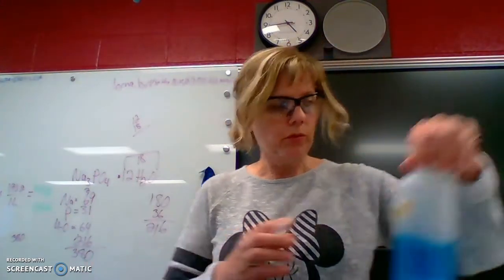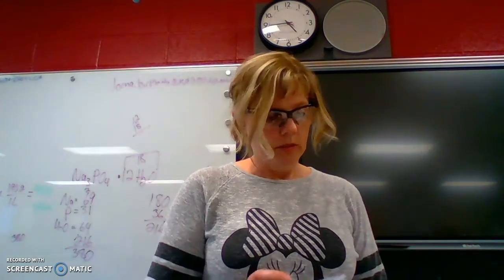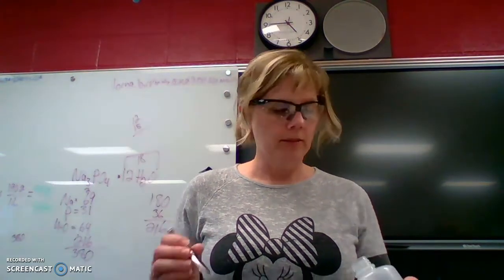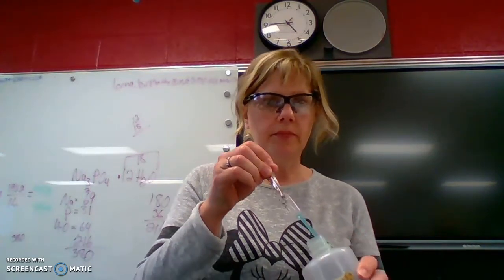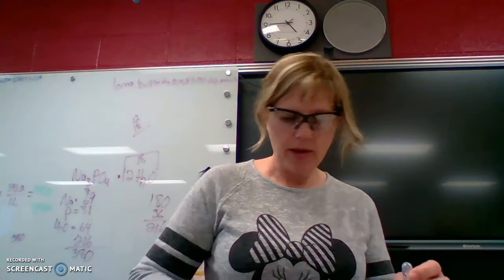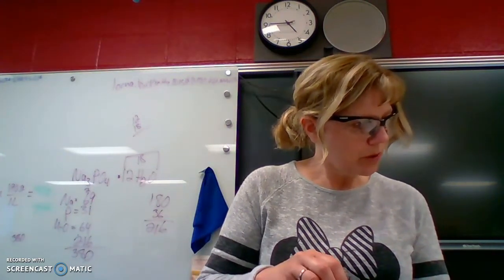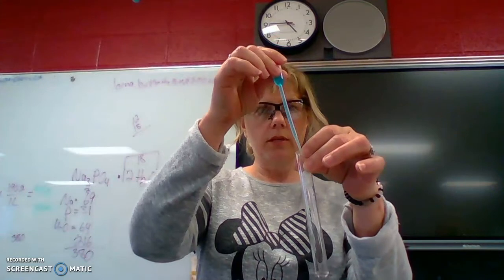All right, I'm going to do my copper 2 chloride first. Okay, the pipette fell in there, so just a moment. We're going to do a little pipette extraction here. So I have my pipette of copper 2 chloride, and it says 40 drops. So I'm going to put that in my test tube.